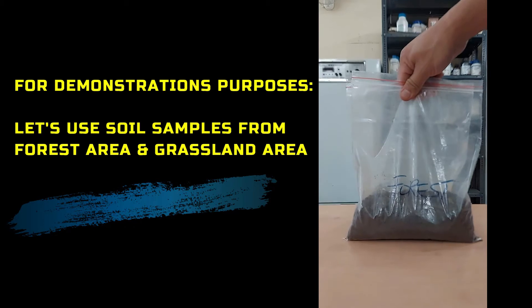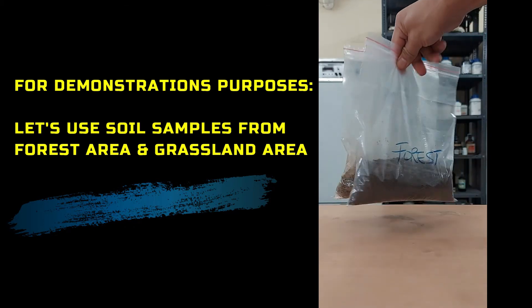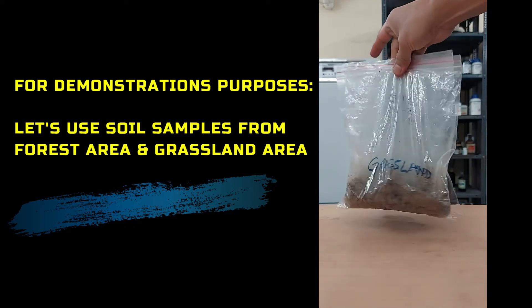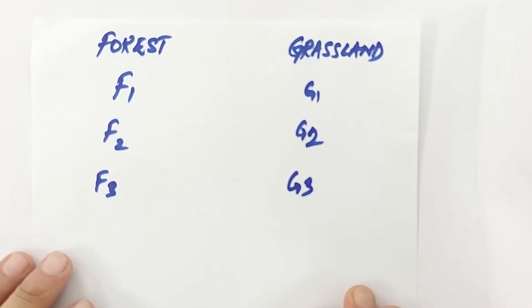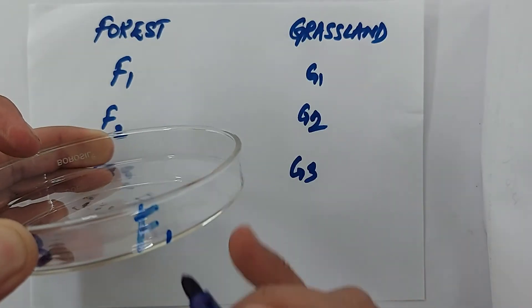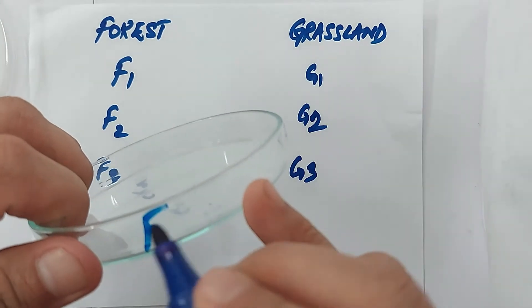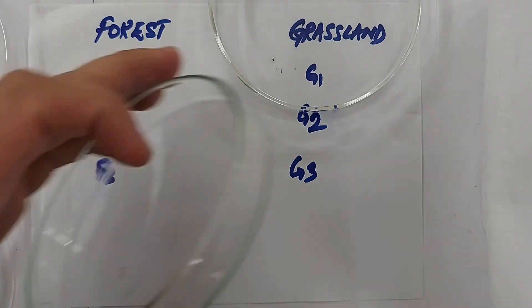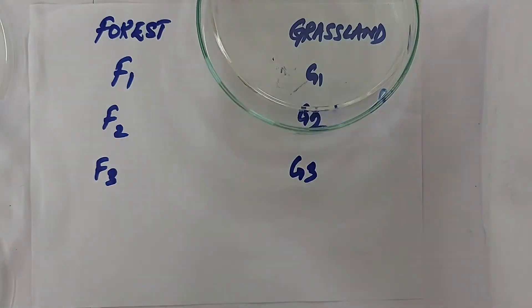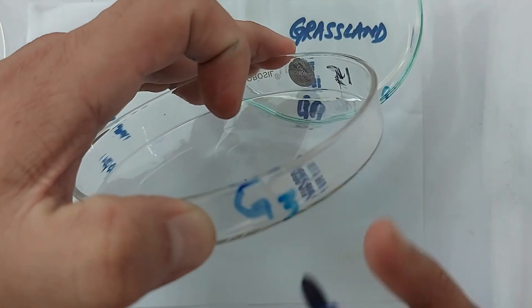Next, take the petri dishes and mark or number them. In order to avoid confusion, let us code the petri dishes for forest area as F1, F2, and F3, and for grassland area as G1, G2, and G3.